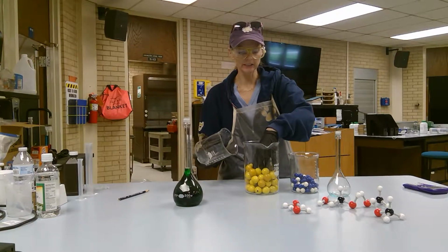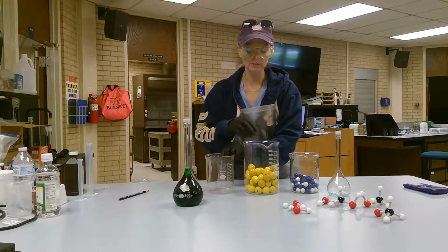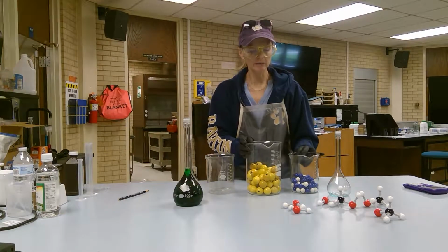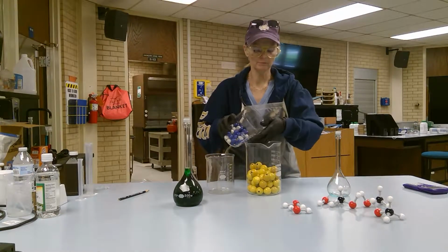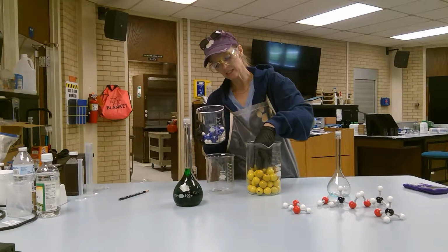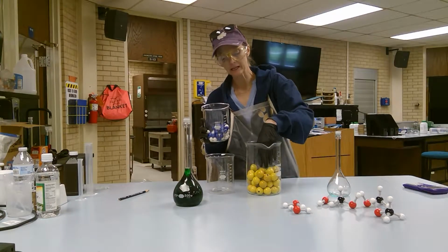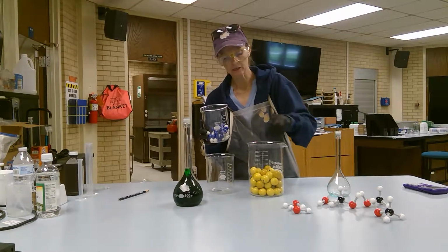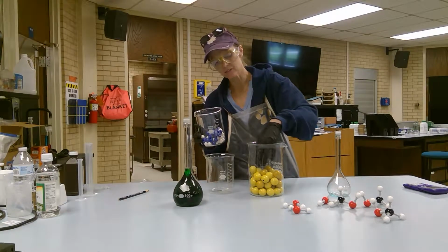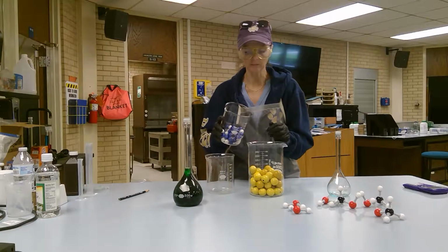And this is basically going to show you that these methanol, when put into the beaker here, if I combine them with the water, they fill in, because if you look, you can see that the methanol take up space. And I'm using a larger beaker to show you that there are empty spaces even though I'm filling up my beaker here.